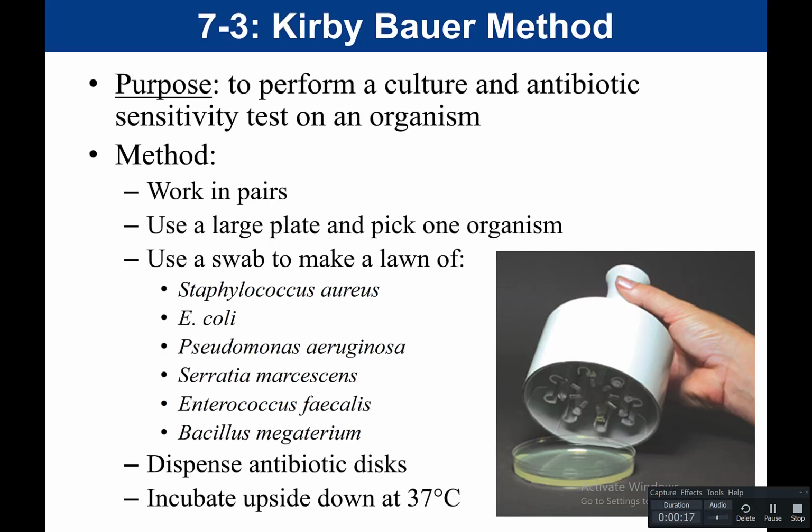So in this video, I'm going to cover the Kirby-Bauer method, day 1, which is going to be our setup. This is also known as the disc diffusion assay or an antibiotic sensitivity test. And so this is activity 7-3. The purpose of the Kirby-Bauer method is to perform a culture and antibiotic sensitivity test of an organism.